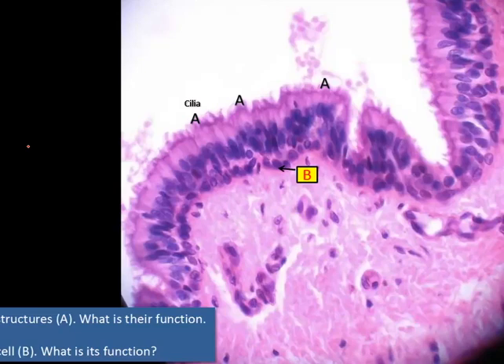It's a pseudo-stratified epithelium. There are basal cells that do not reach the surface. Most of these basal cells are in fact stem cells that maintain cell replacement in the epithelium. Their nuclei form a row in close proximity to the basal lamina.